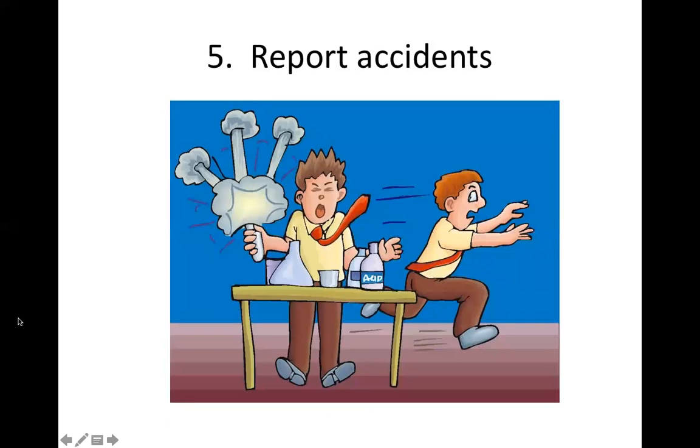And then number 5, report accidents. Now, accidents are not intentional, and although the first or common reaction is for you to be afraid because you did something wrong or you broke a glassware, please do not hide it. You have to report it to your teacher. So reporting it to your teacher can prevent further accidents from happening.